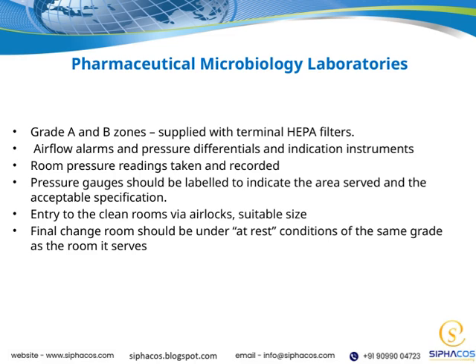Finally, the final change room should be kept under at-rest conditions, meaning no activity occurs there, and should be of the same grade as the room it serves. This consistency helps maintain environmental integrity right up to the point of product handling or testing. Overall, these measures work together to create a controlled, sterile environment essential for pharmaceutical microbiology, ensuring product safety and quality at every step.